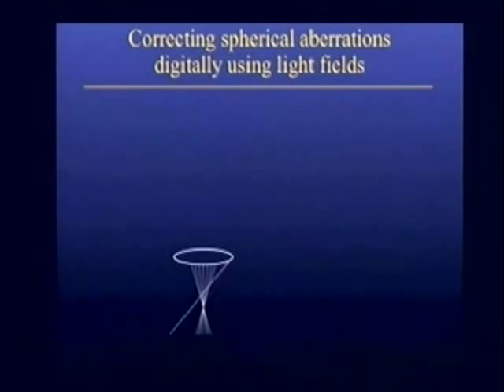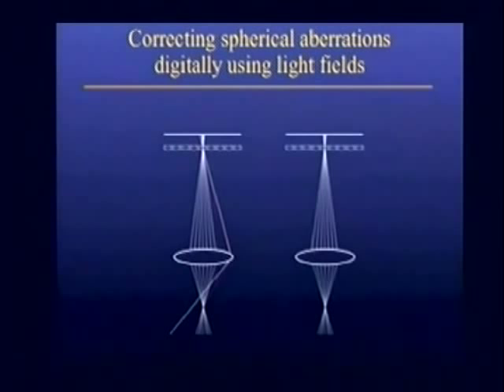So what happens in a light field recording or illumination system? Put in our micro lenses, the paraxial rays do that. The ray we didn't want ends up right next to the rays we did want. The ray we really wanted, the red dashed one, is actually recorded. It's recorded separately, but in a separate micro lens. So that suggests that just by combining rays from different microlenses, we can produce a good focus even in aberrant situations by resampling the light field.